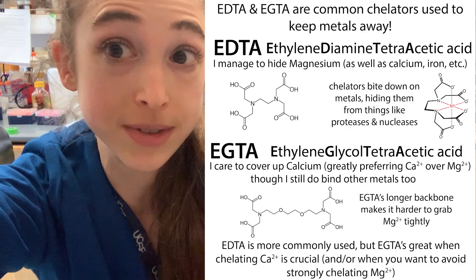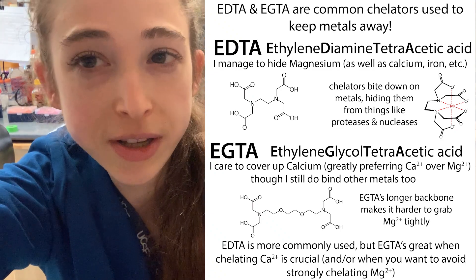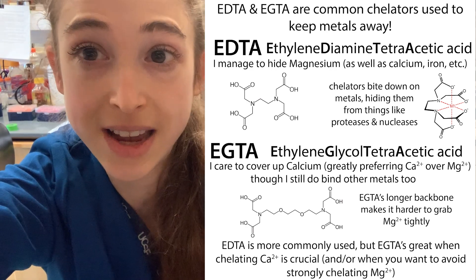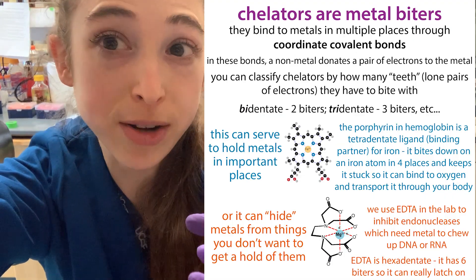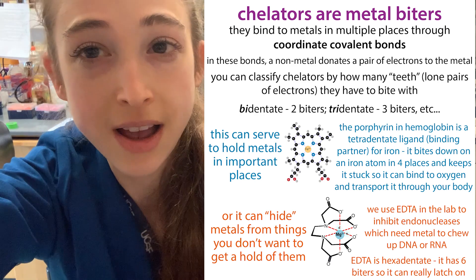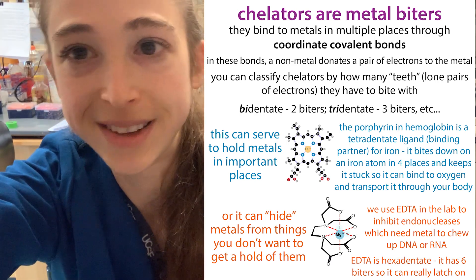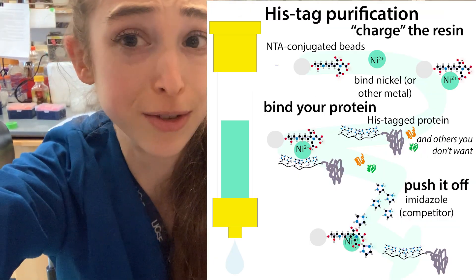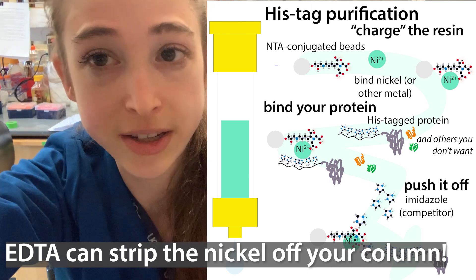Your sample might be safe from the proteases, but not from the protease inhibitors themselves. If you're working with something that is metal-dependent, or you're going to do a His-tag purification, you want to use one that's EDTA free. EDTA is a chelator — a metal binder — and it's going to steal the metal from proteins that need it, or from your column. If you're trying to do nickel affinity chromatography, it'll just come off. So EDTA free is the way to go for that.